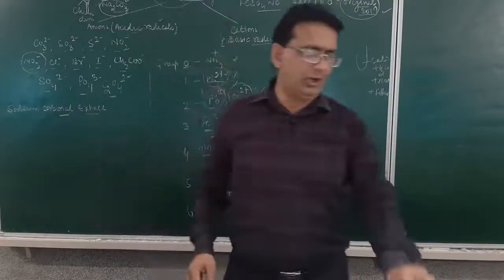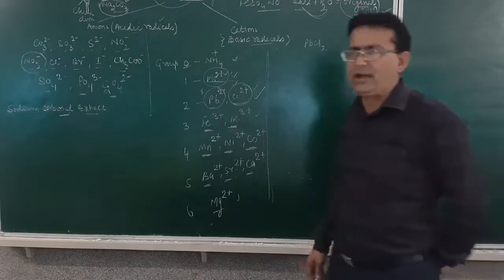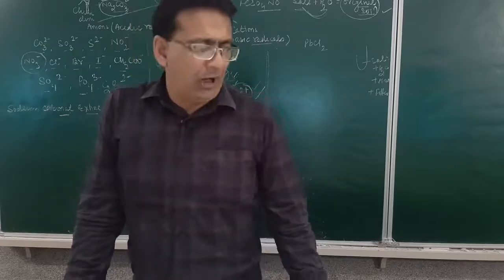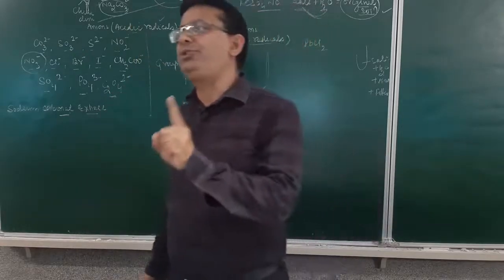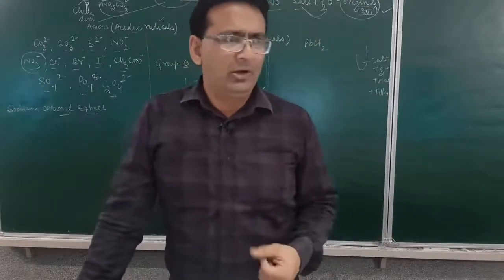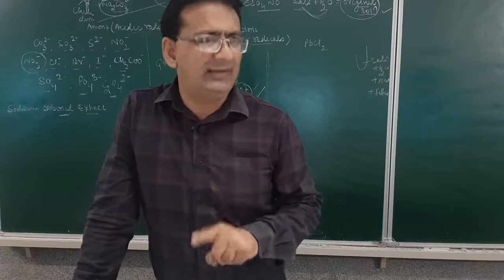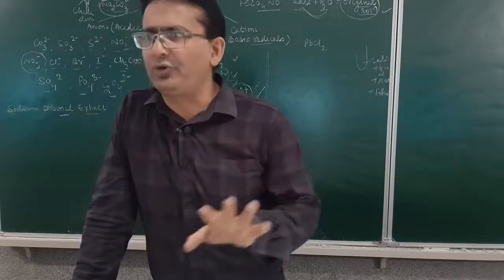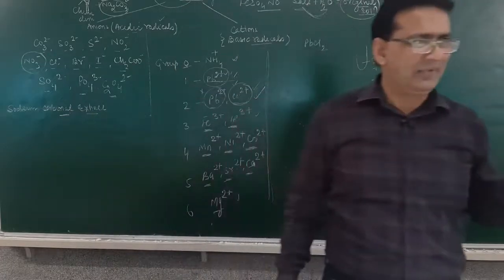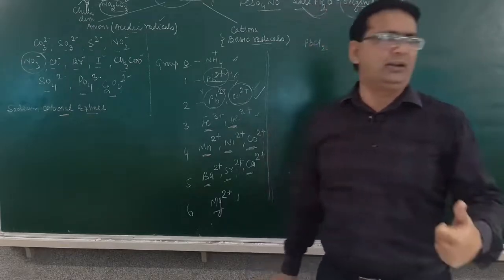Today, since you are doing it for the first time, I have given to you a nitrate anion. I will be demonstrating to you how we identify the nitrate anion also. Am I getting clear? So out of all these, today I am telling you which salt is being given to you. Later, whenever you come next to the lab, the salt will not be told to you. You yourself have to identify it. But since today is a demonstration day and the first hand experience of yours in this practical in the lab, we are telling you the name of the salt.